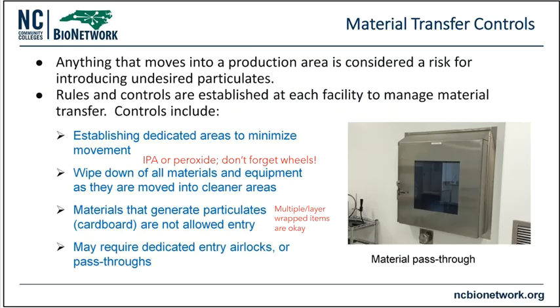Well, okay, enough about me, enough about you, enough about the dirty trash cans that we are. There are other things that can contaminate these areas as well. And these are all of the tools and all of the equipment that we are using, of course, that can bring contamination into the picture. So anything that moves in and out of production is going to have to undergo the same scrutiny as we do when we go into those rooms.